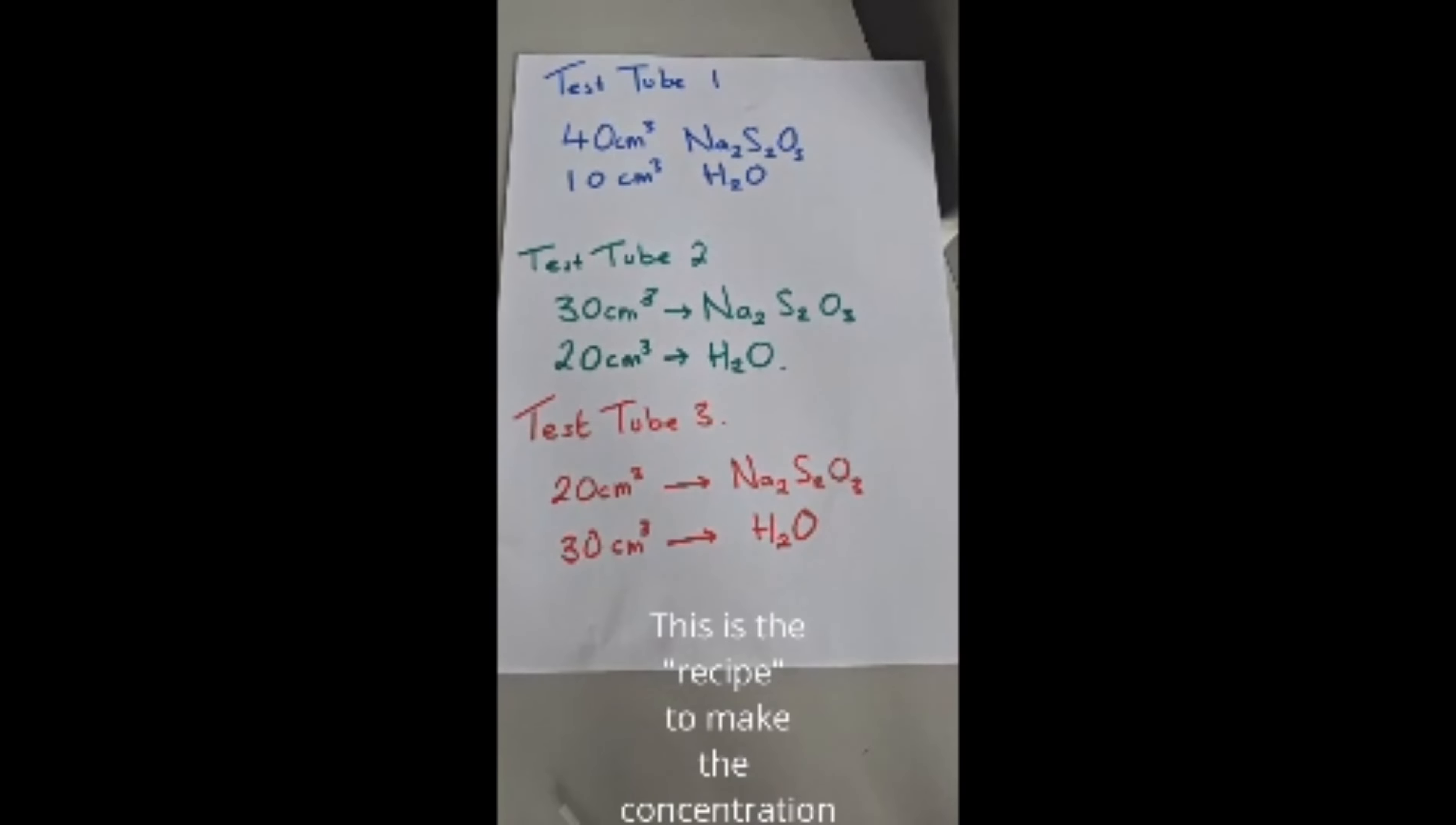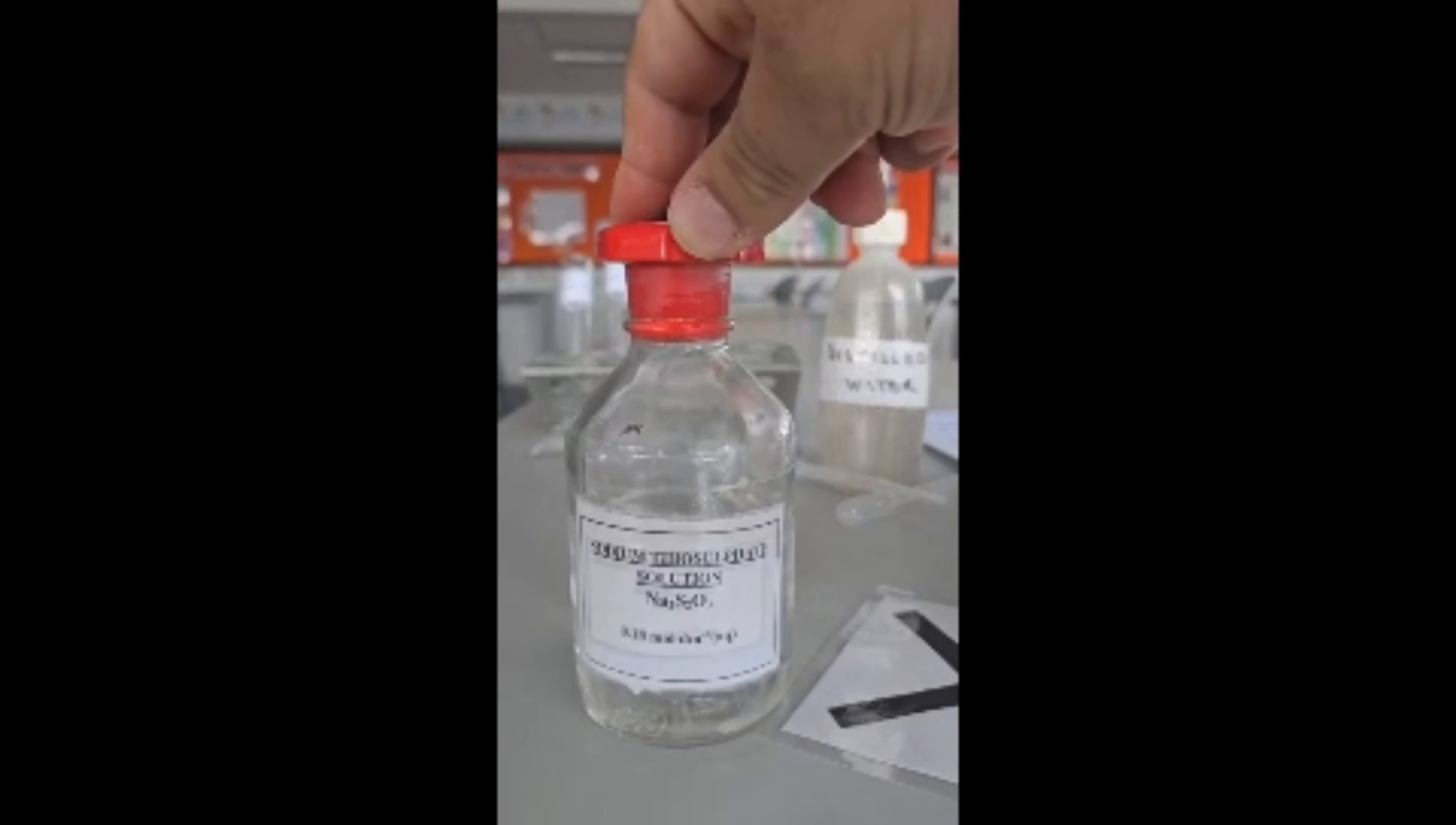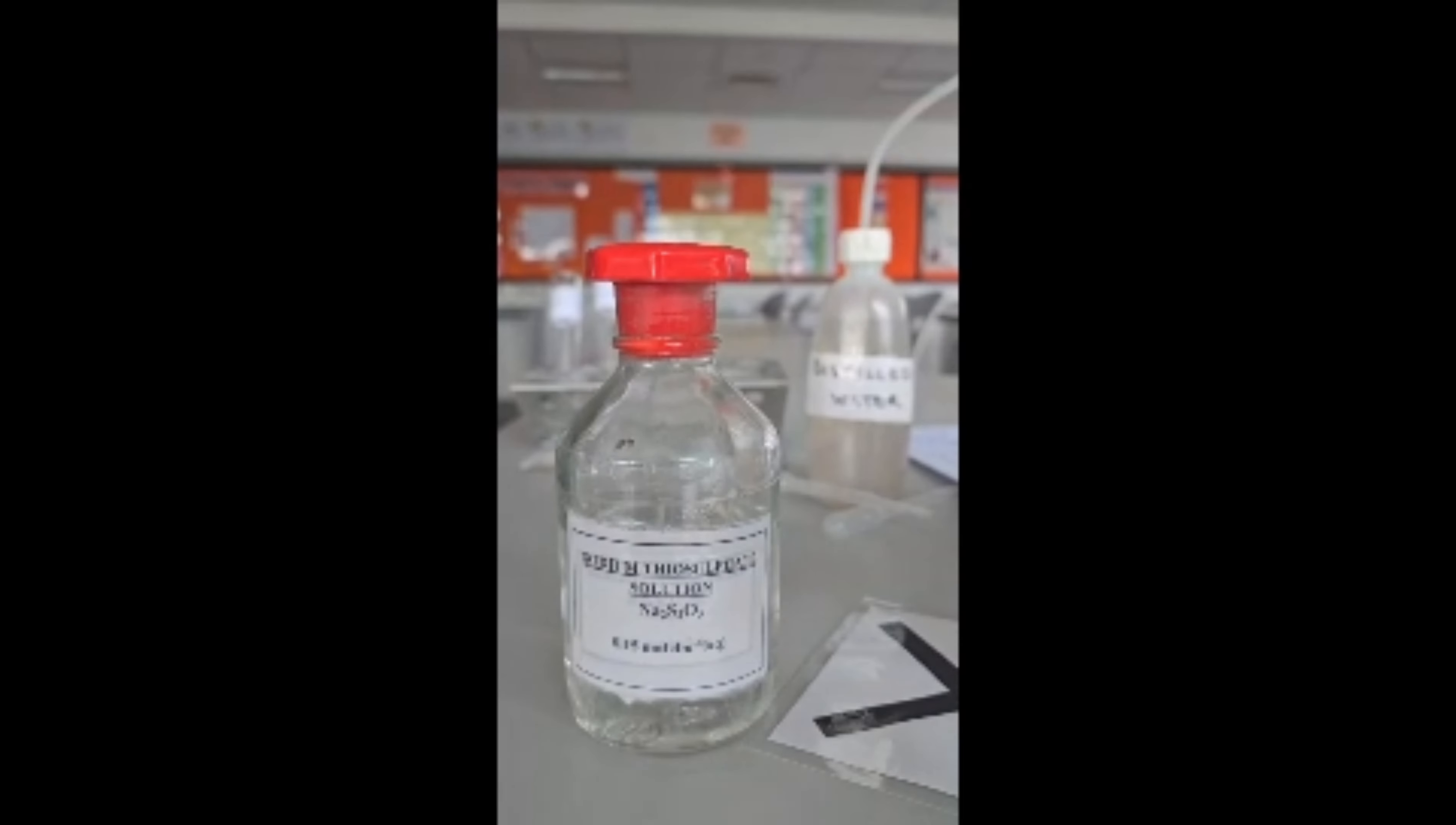Here is the recipe sheet which shows you how to make the different concentrations of sodium thiosulphate. Here is the sodium thiosulphate.